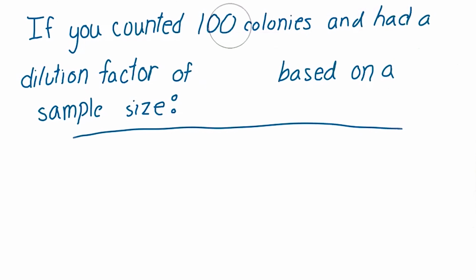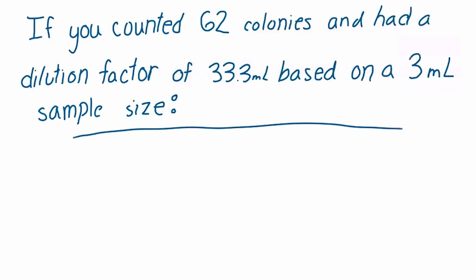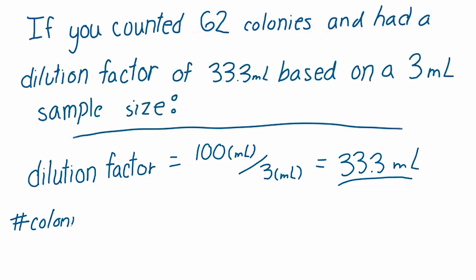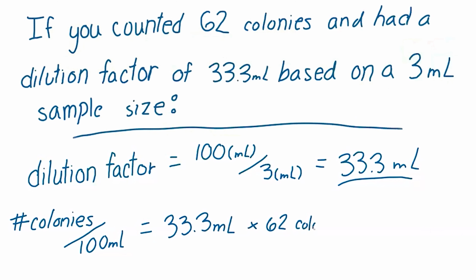For a 3 milliliter sample size, if we counted 62 colonies, we find the dilution factor by dividing 100 milliliters by our sample size of 3 milliliters, equaling out to 33.3 milliliters. We then determine the number of colony-forming units per 100 milliliters by multiplying our dilution factor of 33.3 milliliters by 62 colonies counted to come up with a total of 2,064.6 colony-forming units per 100 milliliters.